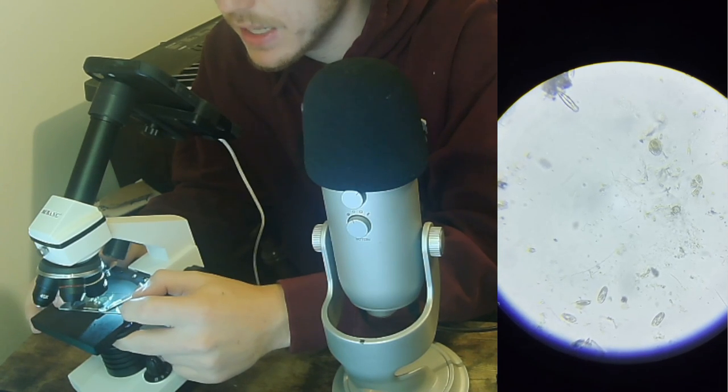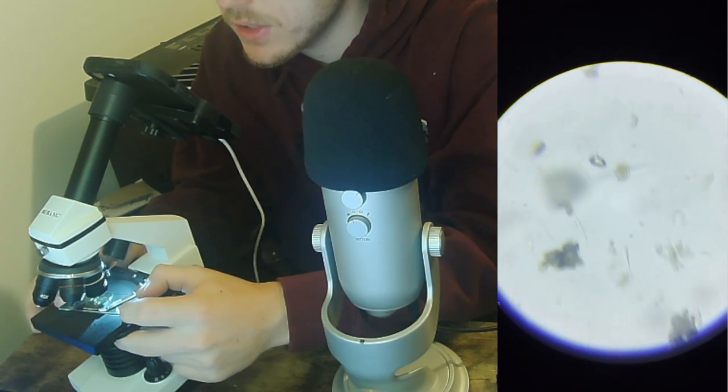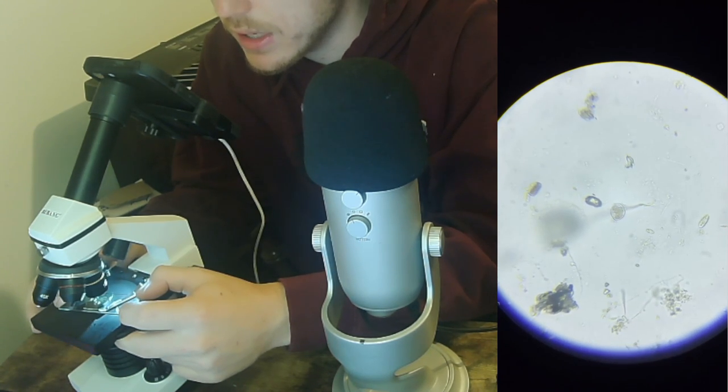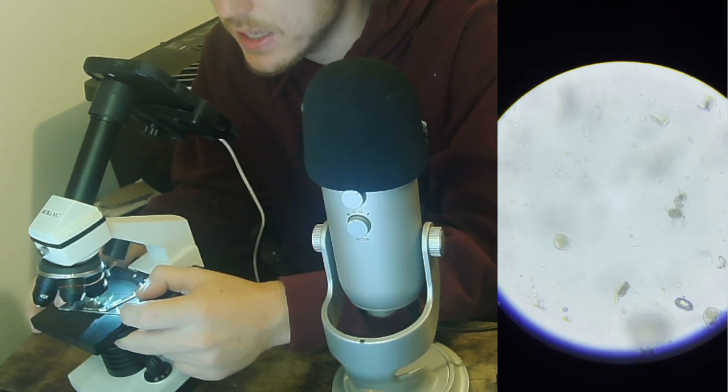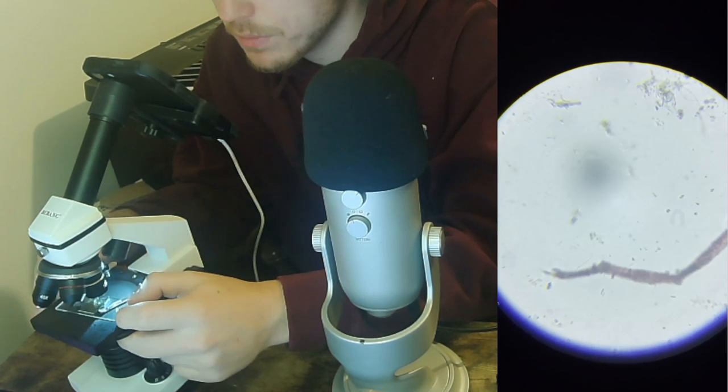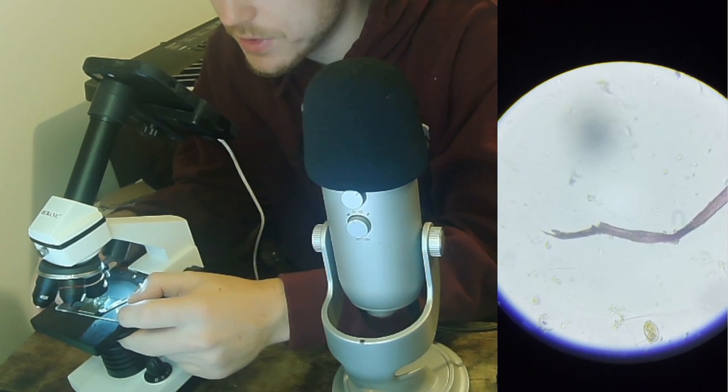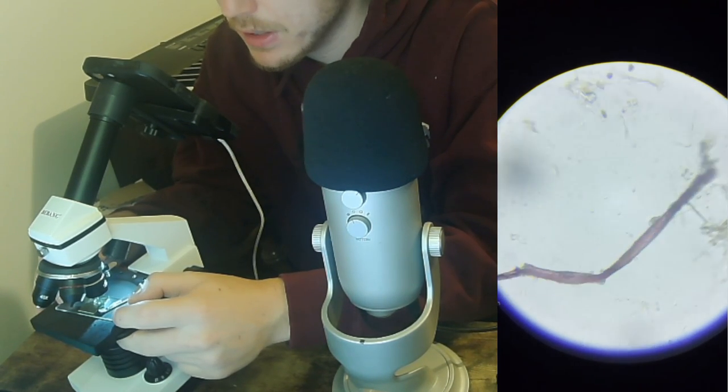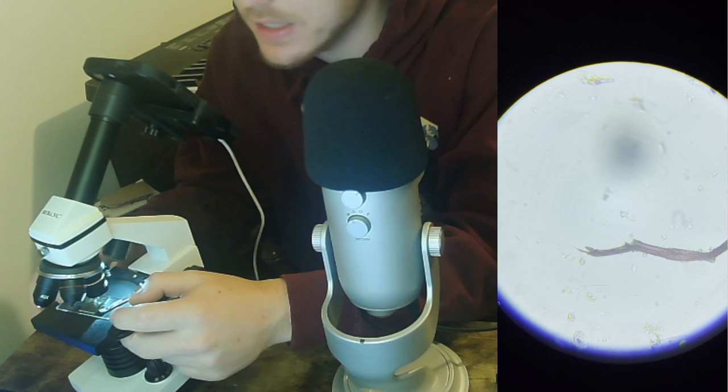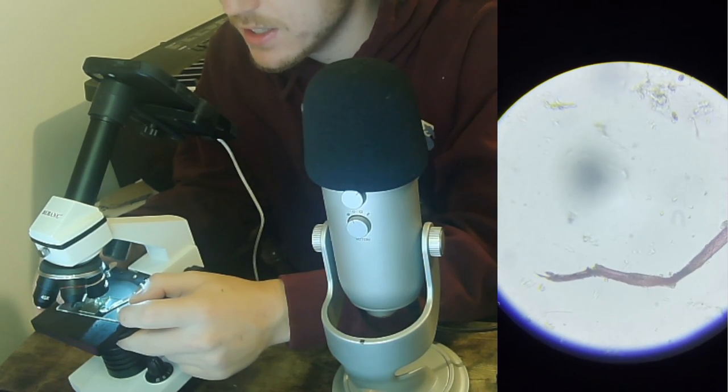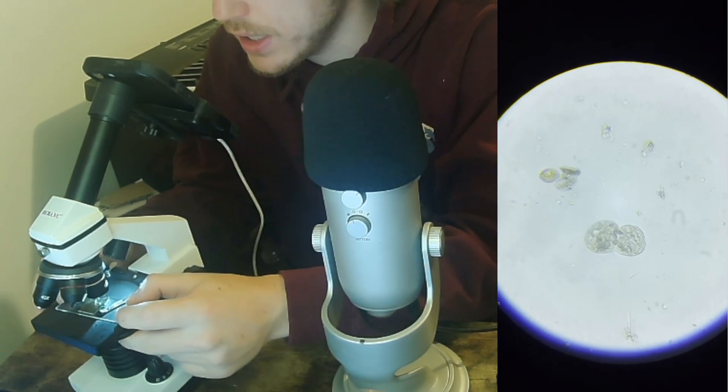Very interesting little guy surrounded by all these little guys that move around kind of fast but they're chilling right now. Look at that wavy guy in the back. There's another one of those diatoms. Now these guys are everywhere, these little circular guys that you can see their insides. They got stuff going on inside them. Is this a claw? This looks to be the claw of some kind of insect. So some insect lost its claw, its appendage, and it is now ended up tiny under my microscope.